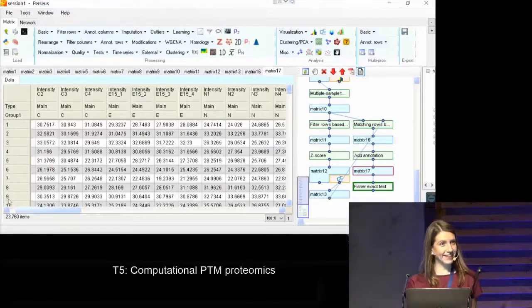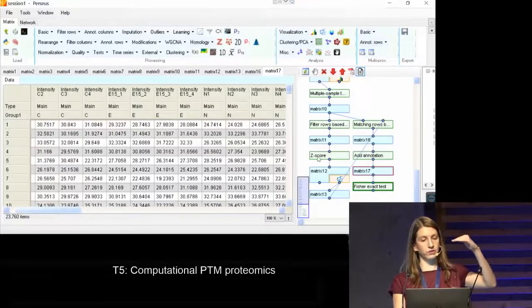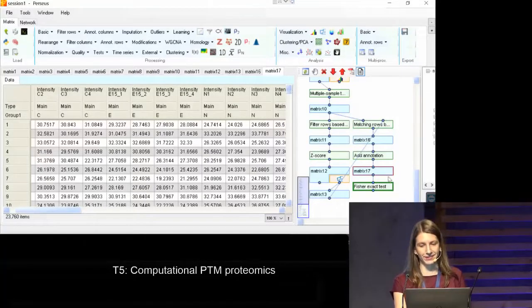Sorry, I was wondering about normalization. Yesterday, it was done really at a later stage in the workflow. I'm wondering why is that? Are you talking about this part? Yes, of course. So this you actually want to do only before clustering and only for the purpose of clustering, because this is normalization across the different conditions of a protein. So you apply it only for this. If we were to normalize based on the samples, this of course you will do much earlier. So you're absolutely right. It's just what and how we're normalizing. Yeah, thanks.